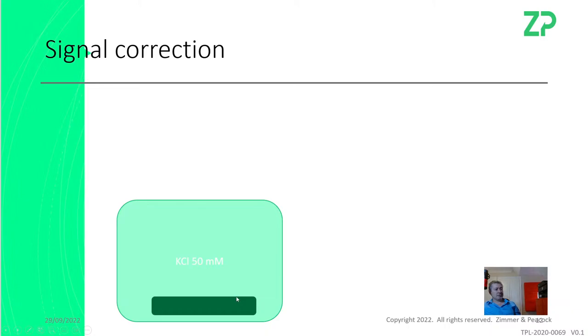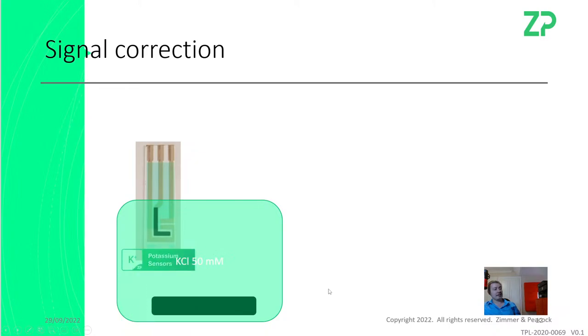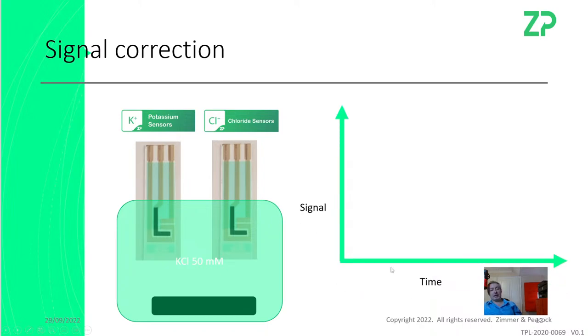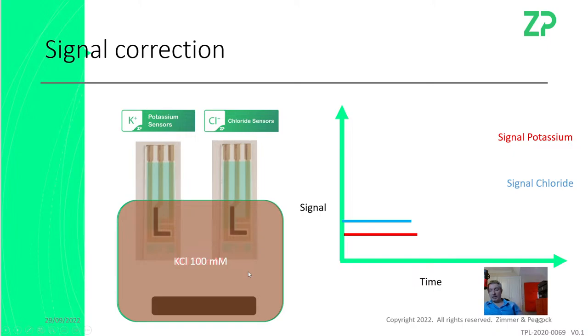Just want to talk here about the idea of using potassium and chloride together. So I'm imagining that you've got a beaker, for example, with 50 millimolar potassium chloride in there. You've got a potassium sensor in there, and you've got a chloride sensor in there. What I'm imagining is that we have signal. I could really have written voltage here, but we have signal. On the potassium sensor we have a certain signal, and on the chloride sensor we have a certain signal. And then we double the concentration. We add in an aliquot of concentrated solution, we stir it up quickly, and the signals change. If we're not protecting the reference electrode on the potassium sensor, and it is chloride sensitive, then we're going to end up getting a change on the potassium sensor that's twice what I would have otherwise expected.